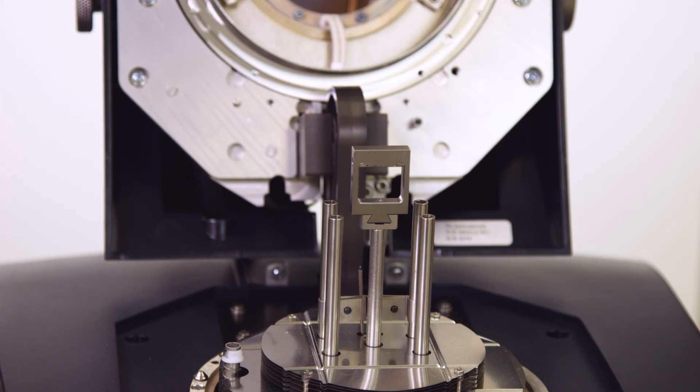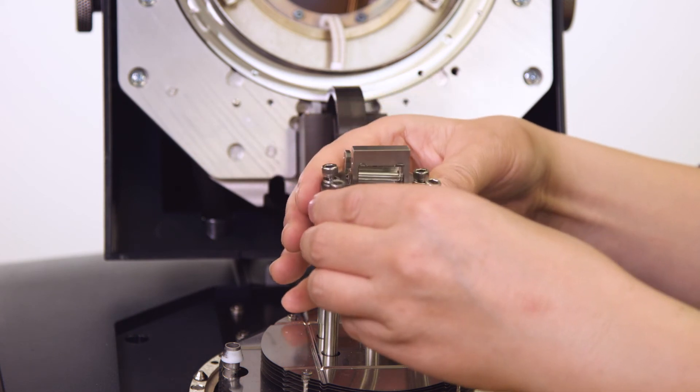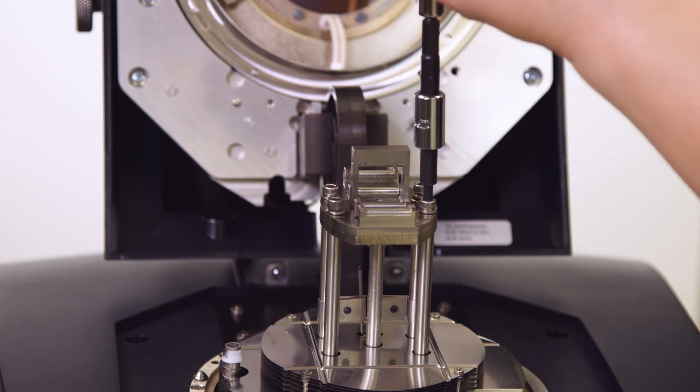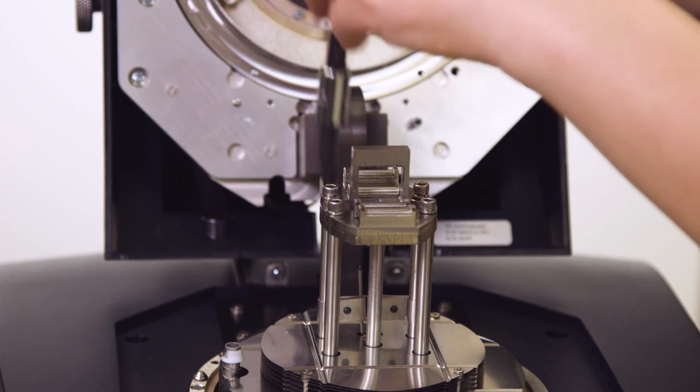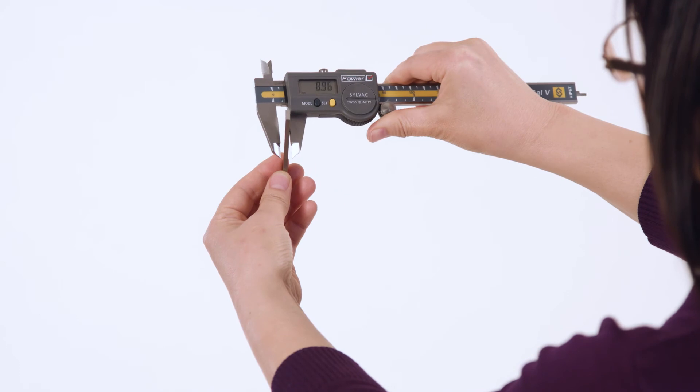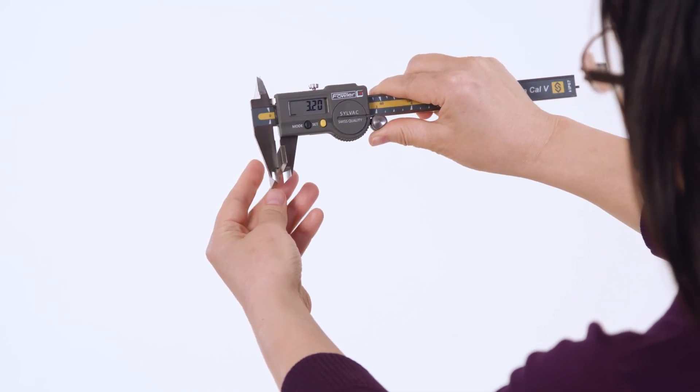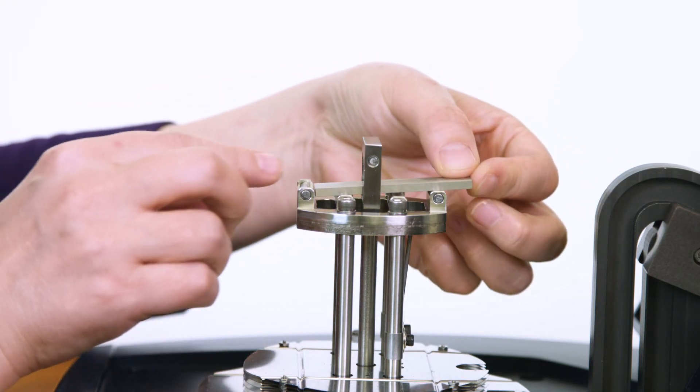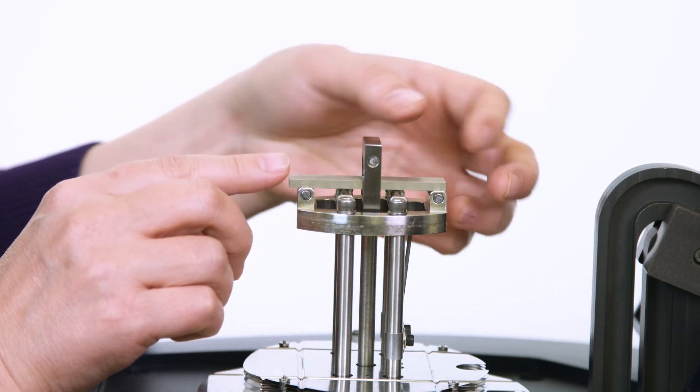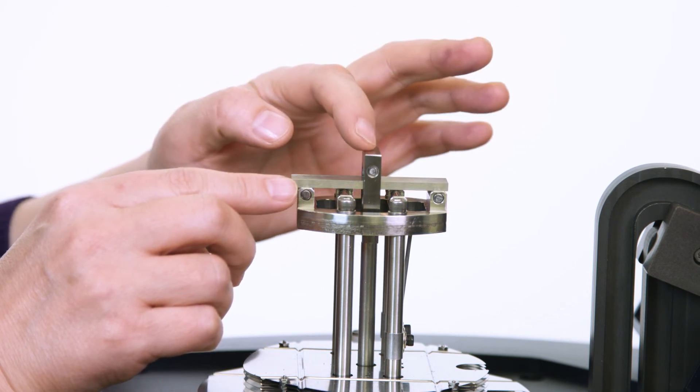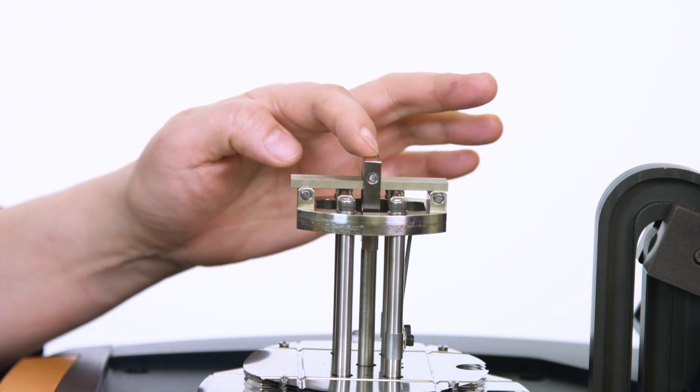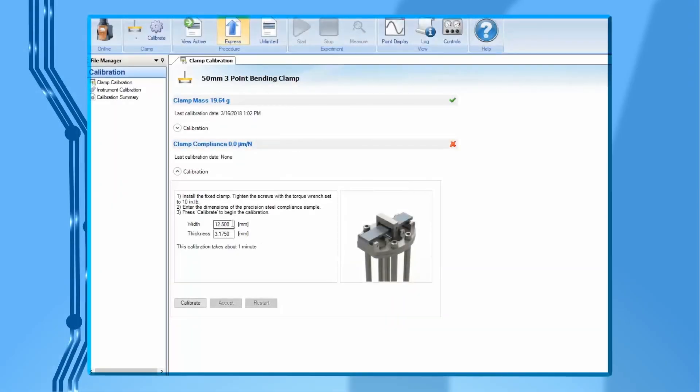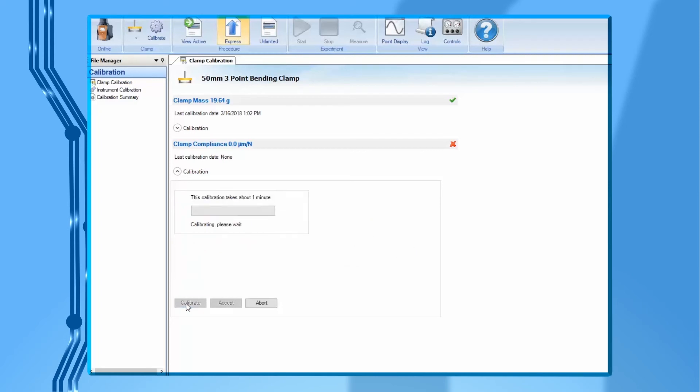The second step is clamp compliance calibration. Install the fixed clamp to the four posts. Tighten the screws with the torque wrench set to 10 inch pound. Use a caliper to measure the width and thickness of this precision steel compliance sample. Then load this steel sample to the clamp. Use your finger to push the movable clamp until it is in full contact with the steel bar and align the bar properly. Enter the steel sample width and thickness into the software. Then press calibrate to begin.